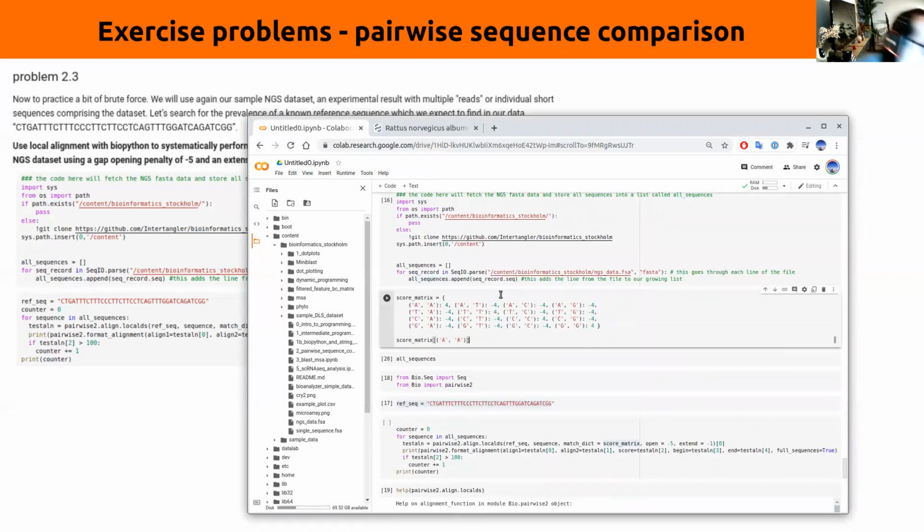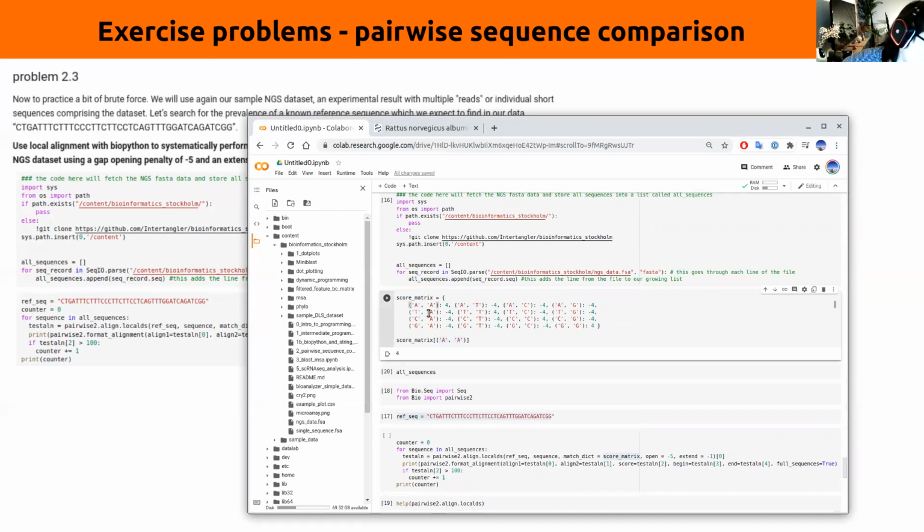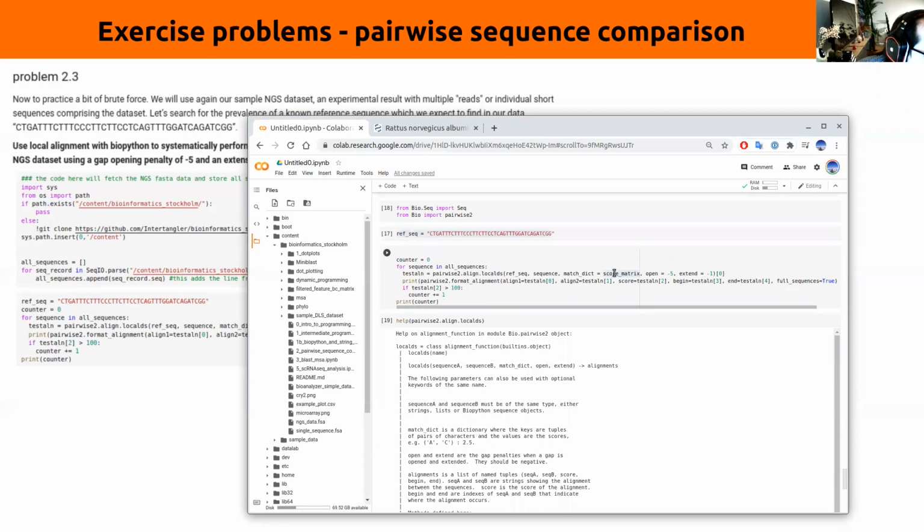So we just run this, and you can see it works the exact same way as our blosum matrix, but instead of amino acids, we have DNA codes, and the scoring system just gives +4 points for a match and -4 for a mismatch. Very simple. And you can use it the same way, right? You supply in parentheses here a pair, and then you get back a score. So that's the score matrix that goes into this pairwise2.align.localds function. And then we provide a -5 opening penalty and a -1 extension penalty for the gaps.